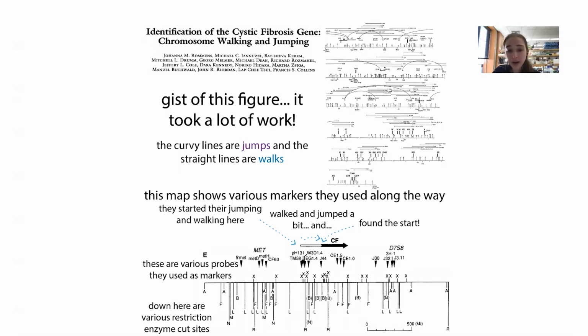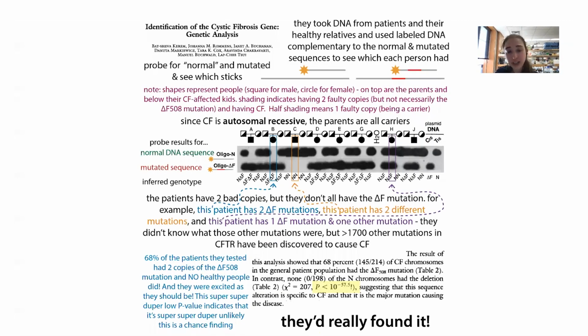And they wanted to see where the gene for it was. So they made all these probes, and then they were doing all sorts of probing to try to find the actual gene, and then they were able to actually find it.